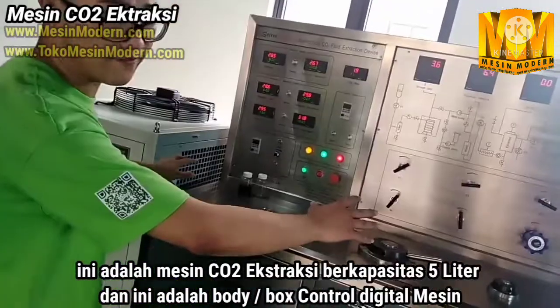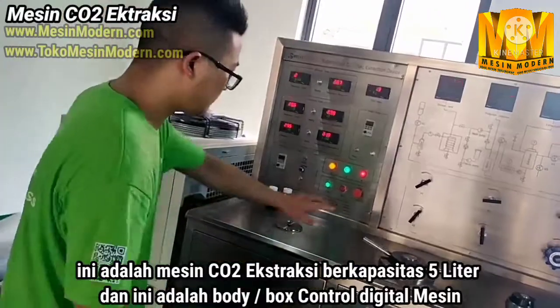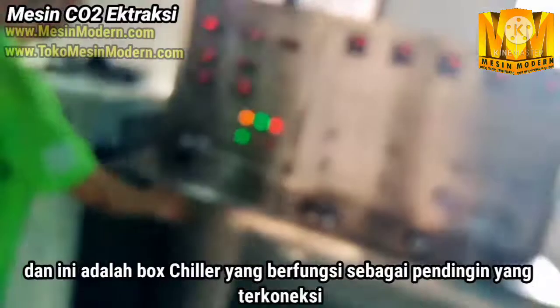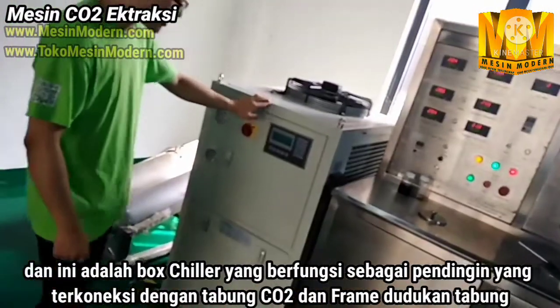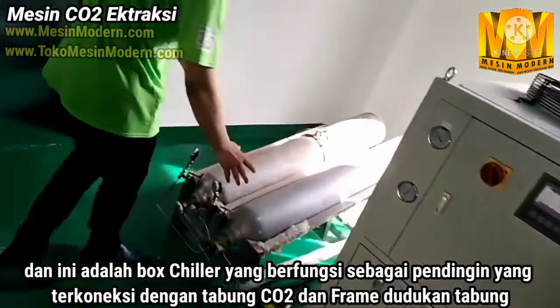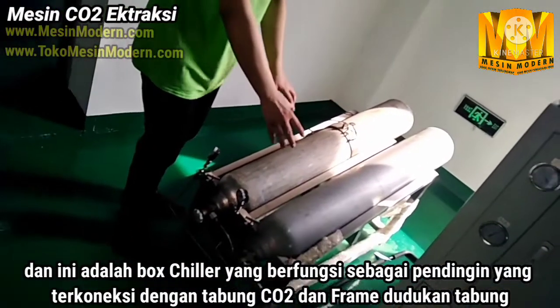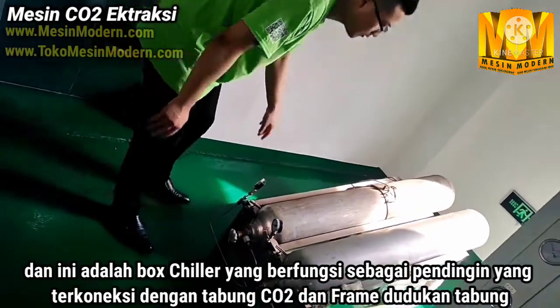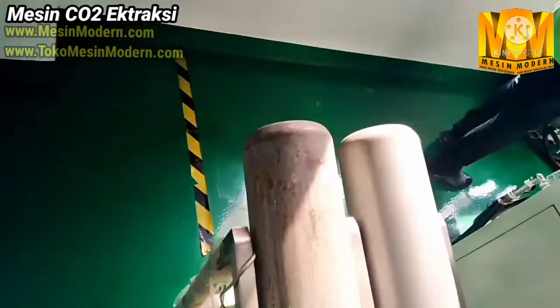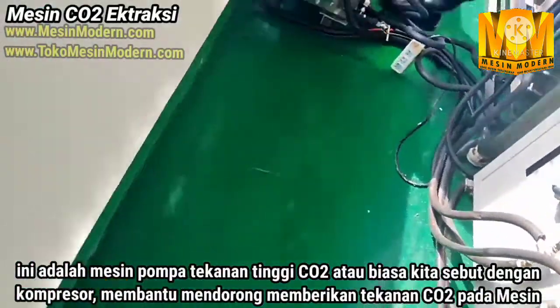Here is a 5-liter machine. This is the main body. And here is a chiller — the cooling system. And here you can see the CO2 bottles for CO2 supply. And this is the frame.